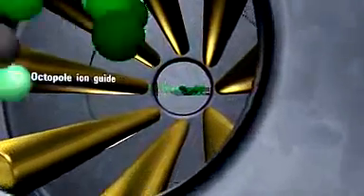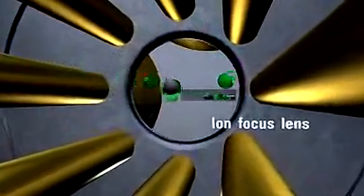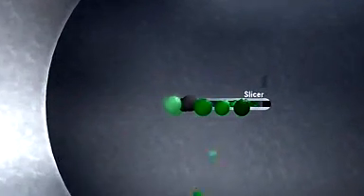Another octopole ion guide keeps the ions together while allowing excess collision gas to be pumped away. A quadrupole ion guide flattens the stream of ions for better transmission through the slicer. The slicer reduces variations in the vertical momentum of the ions.